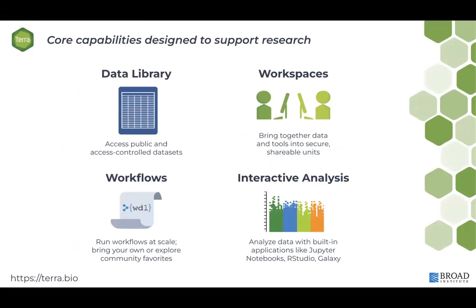And Terra's combination of features empowers you to work as effectively as possible in the cloud. So that includes finding data, because we have libraries, including both public and restricted access data sets, which you can link your access restricted accounts to, like NIH accounts. If you have access to certain access restricted data sets, we have that all wired up so that you can log in through Terra and bring in data from those data sets into your workspace.